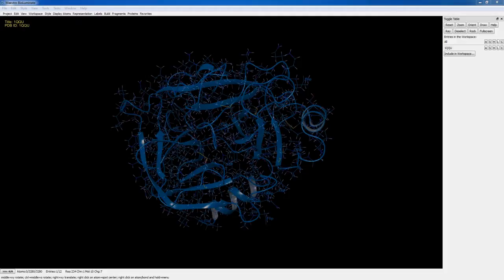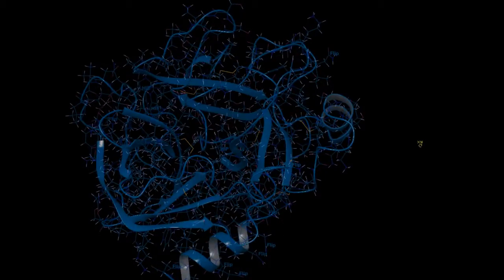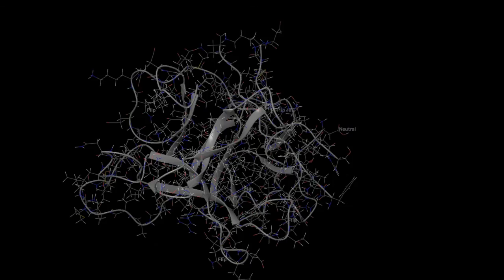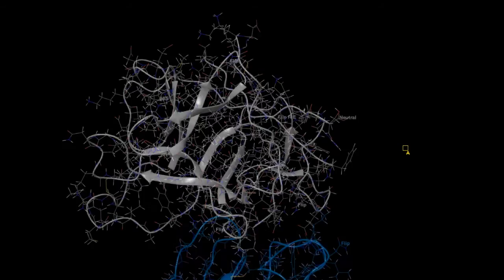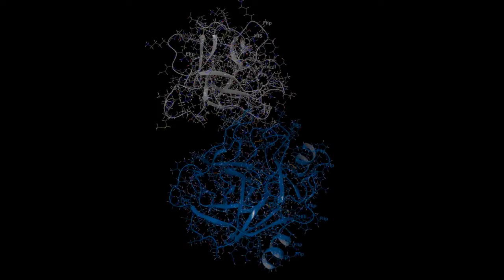The docking is performed as a rigid body optimization and there is no subsequent minimization of the interfacial region. With that in mind, let's begin. The receptor used in this exercise is 1QQU, while the ligand is chain B of 1BA7. Both of these proteins have already been passed through the protein preparation wizard and are ready for protein-protein docking.